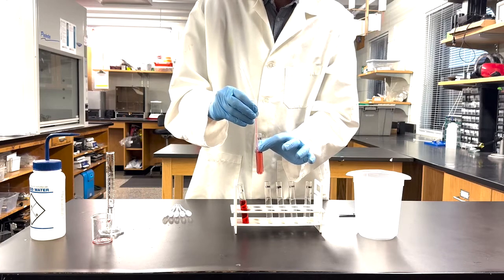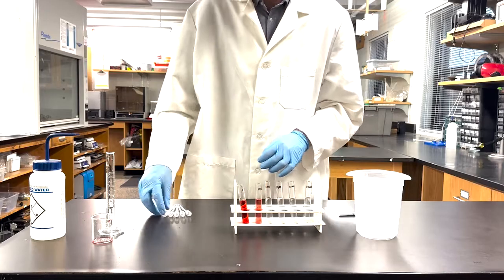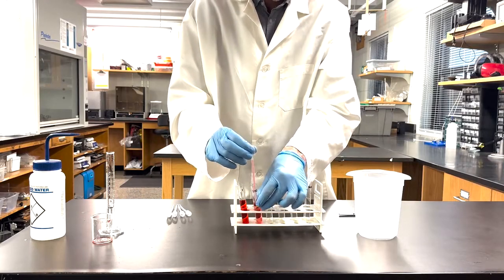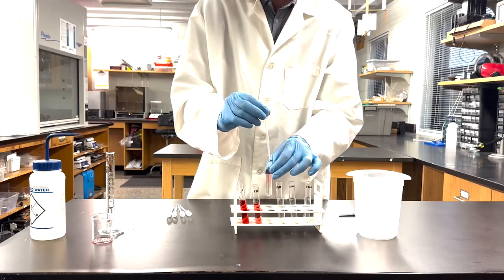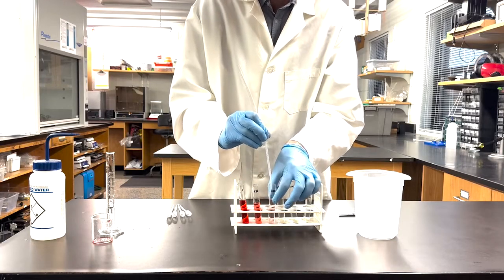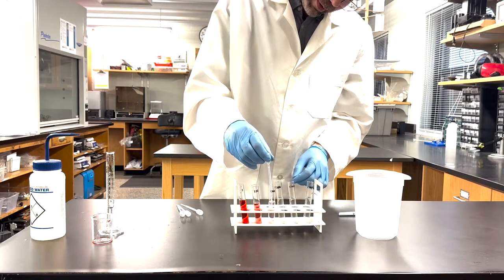When it is fully mixed, withdraw 1 mL from the 1 to 10 tube and add it to the 1 to 100 tube. Mix by pipetting up and down. Repeat this process until 1 mL has been added to each tube.